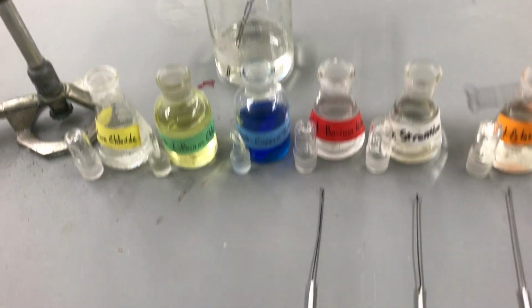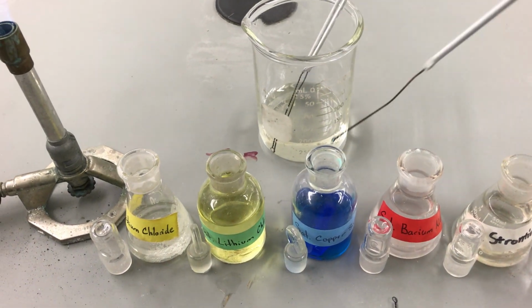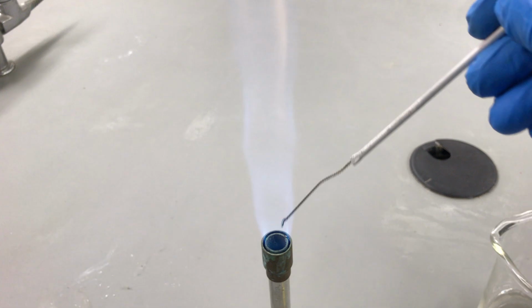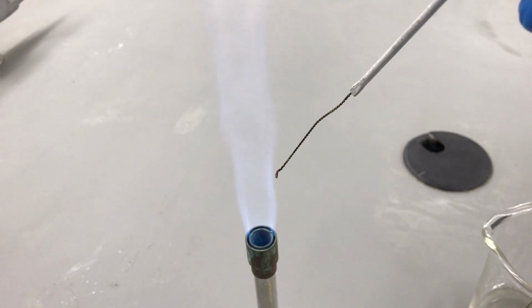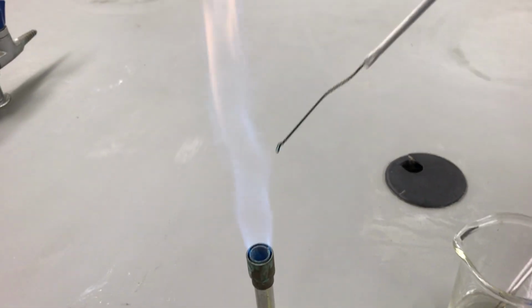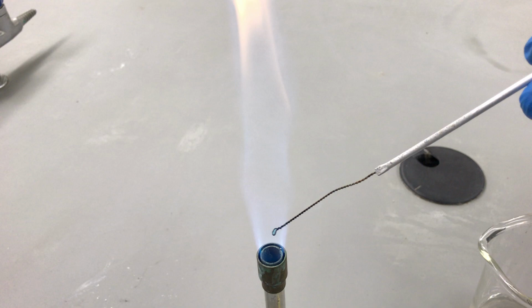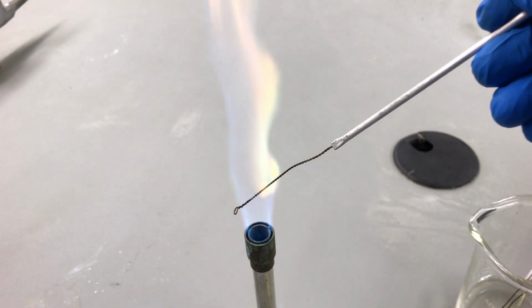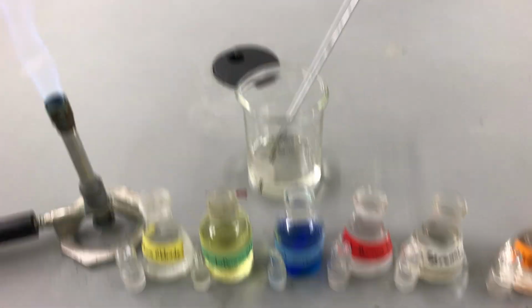Next up, we're going to do our saturated copper sulfate. So just introduce our loop to this copper sulfate, and then we will introduce it back into our flame. So this time, kind of a greenish color, as you can see. It's very quick, so let's try it again. We'll dip it back into our copper, and once again, introduce it to the flame. So once again, that nice green color that you can see, very bright green. So we will put down our copper's results as bright green on our table 2. Make sure we decontaminate that.